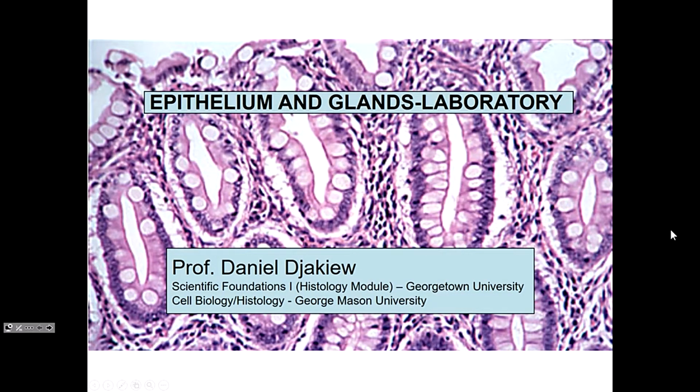So it may be some gland that's secreting a hormone, and the question might be, which hormone does this particular cell type secrete? So first you have to know it's the thyroid gland before you could say that it's one of the thyroid hormones as opposed to some steroid hormone, testosterone, estrogen, whatever, okay, or pituitary hormone. So the questions can be varied in the way that they're structured, but you still have to be able to identify the structure to answer the question for the lab portion.